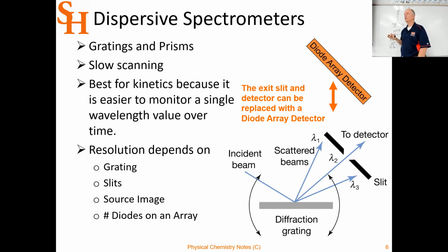But there, for more resolution, you need more pixels. And that ups your cost, but again, they're pretty cheap. So diode array spectrometers are really very cheap and pretty high resolution. They're fairly noisy. We have that in our Raman spectrometer. So when you were looking at the Raman, it went into this little box over here, and that box had a fixed grating and a diode array detector.